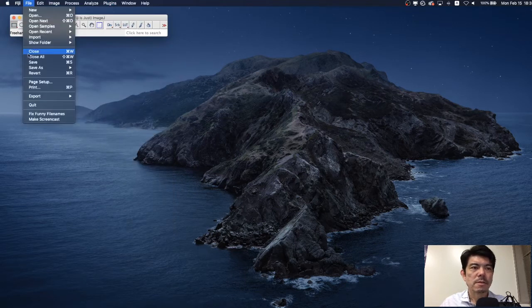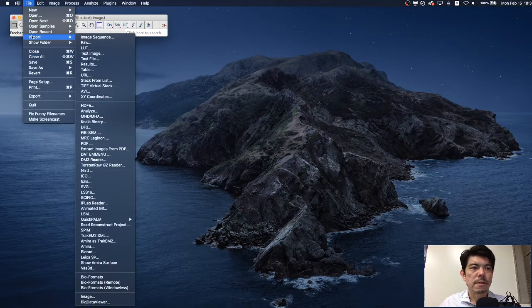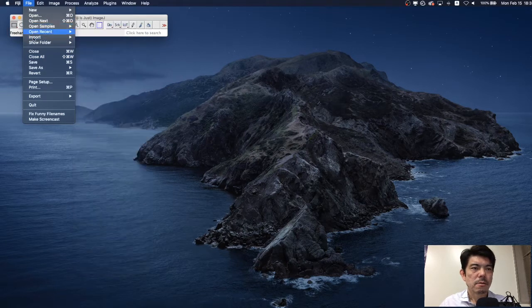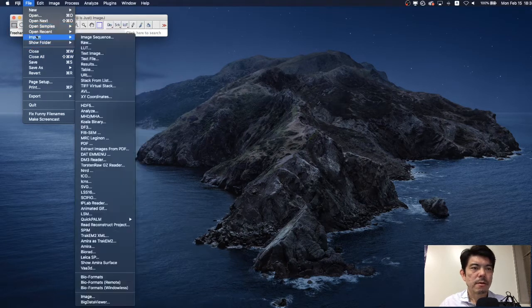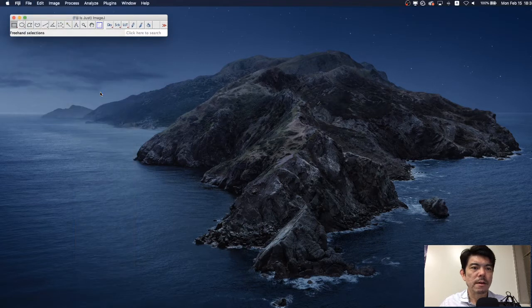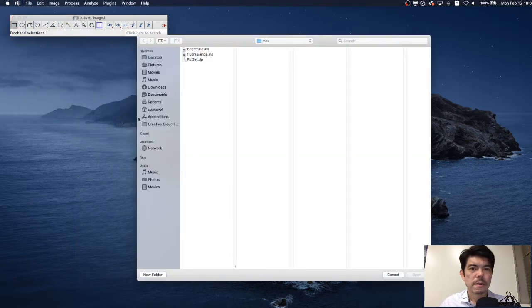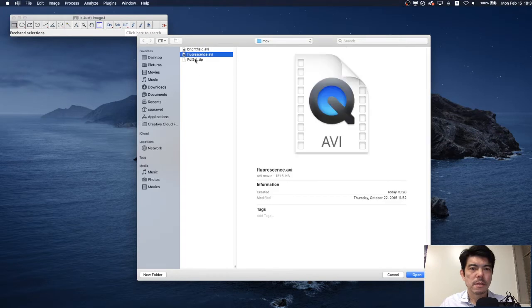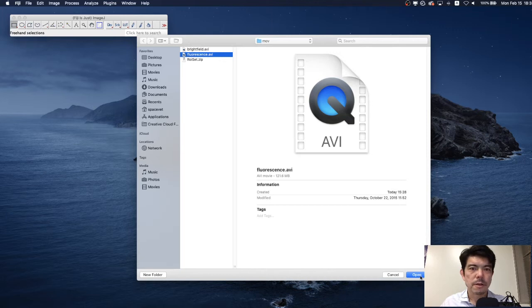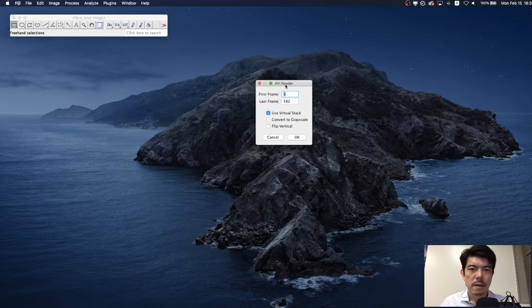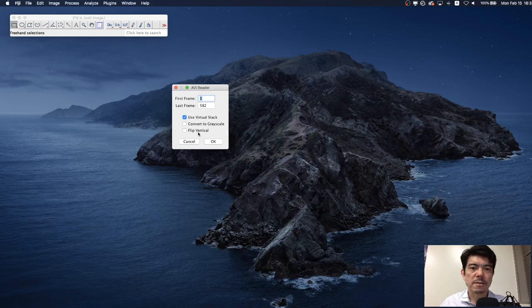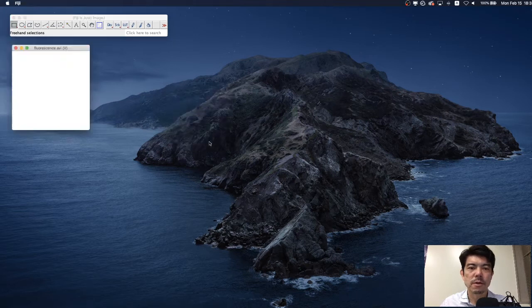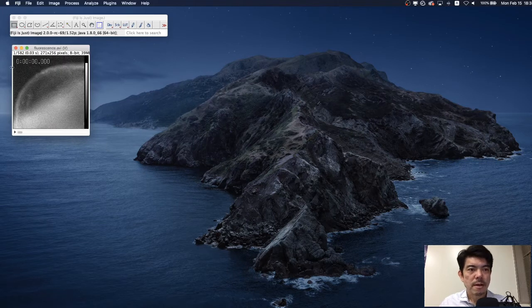Let's open the movie file. Here we have import menu and choose AVI and this is the movie for the intracellular calcium recording. ImageJ is going to ask you about the parameters such as use virtual stack and here is the convert to grayscale menu. Check it and press OK.